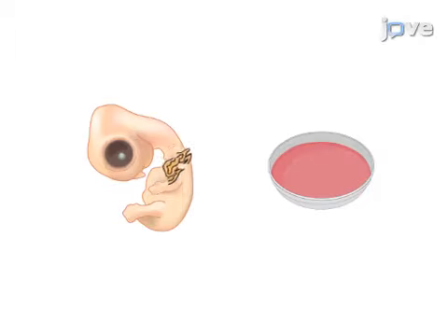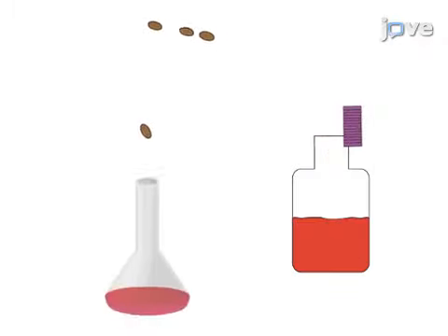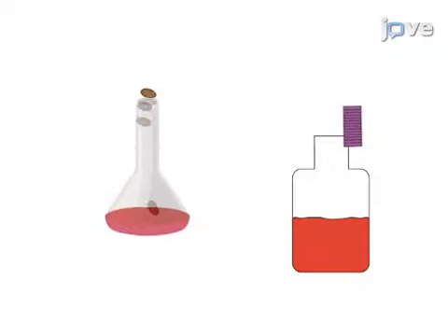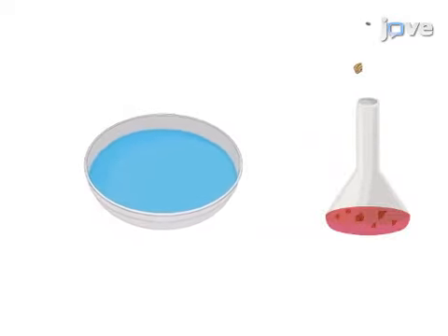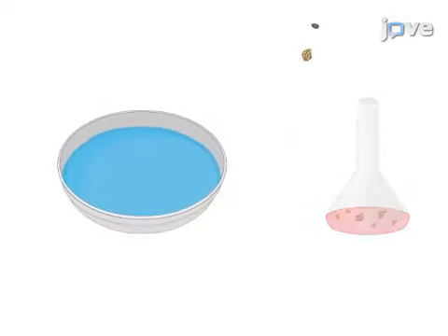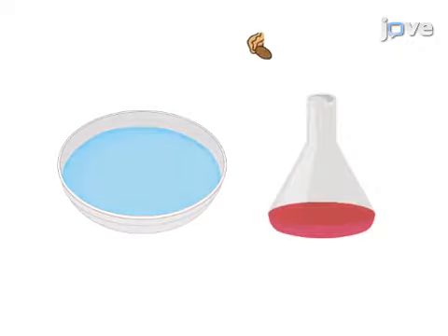This is accomplished by first preparing normal tissue fragments obtained from embryonic chicken hearts. In the second step, aggregates of tumor cells are prepared in suspension. The tumor cell aggregates are then individually confronted with the normal tissue fragments on a semi-solid agar bed for incubation in a suspension culture.